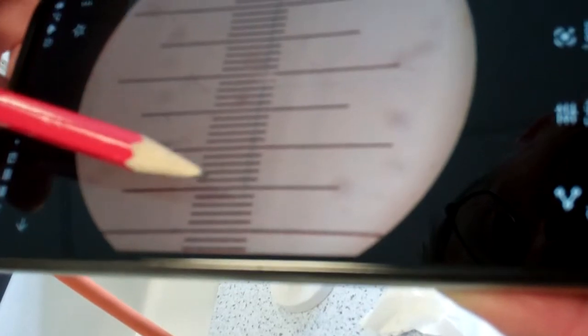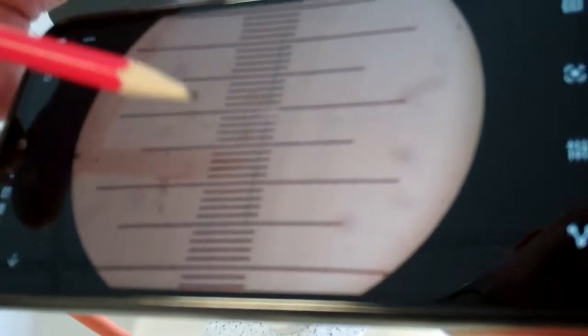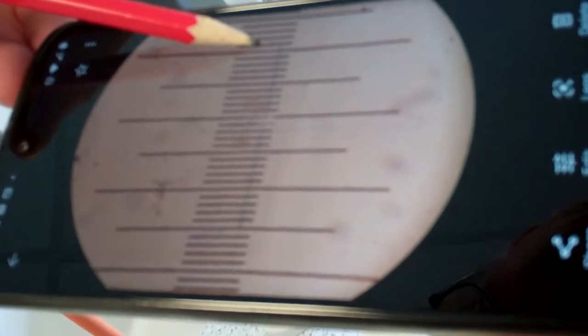So that's 5 divisions, 10 divisions. I've lined up what I see down this lens - these smaller ones going right from 0 there to 10 there, which is technically 100 divisions on the eyepiece graticule.